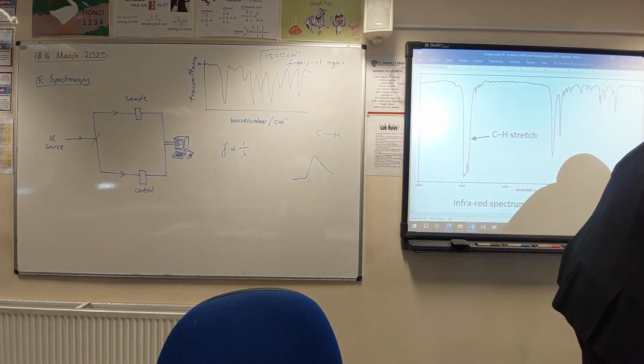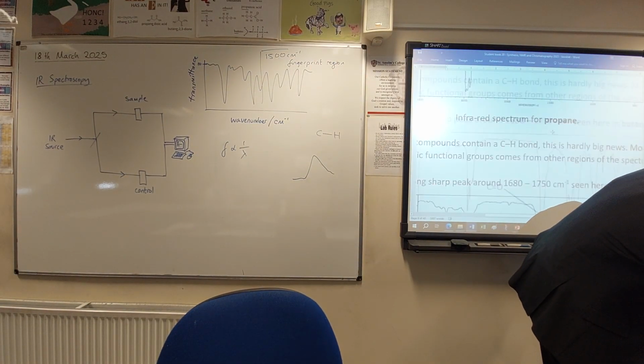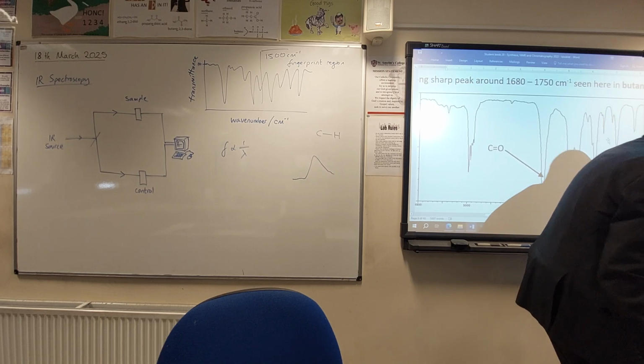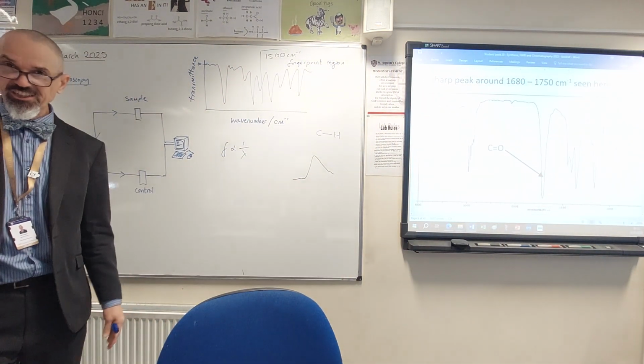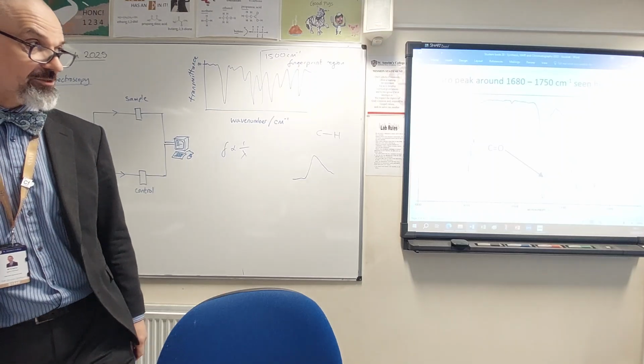So there's just a few functional groups you should really be able to spot pretty much instantly as soon as you look at an infrared spectrum.